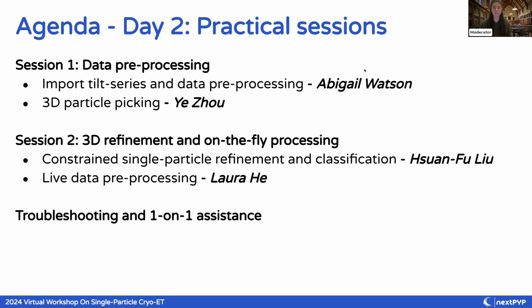Tomorrow is going to be our practical sessions. For those, we'll have two sessions, and the first is going to cover data pre-processing, starting from raw tilt series and going to 3D particle picking. I will be covering the data import and data pre-processing, and Ye will be covering the 3D particle picking.